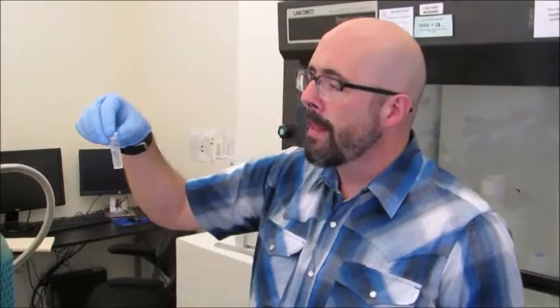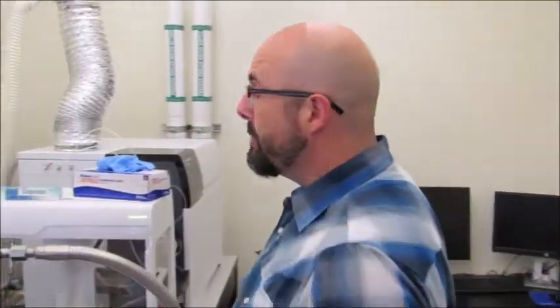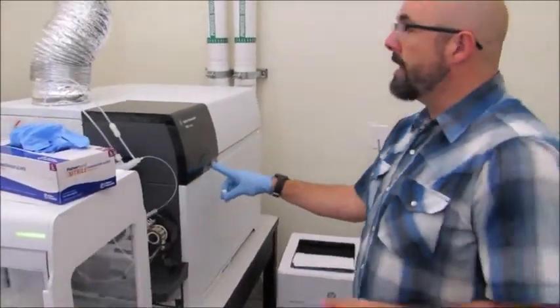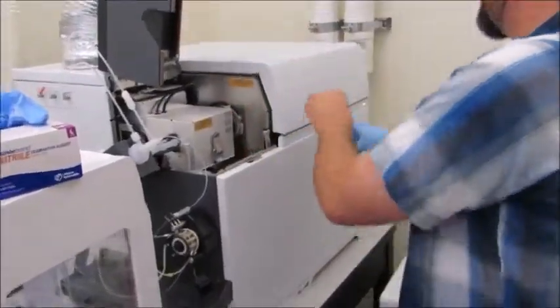The zircon has been spiked so that, just like with the helium system, we can measure the total amount. And then what we're going to do is measure this using this machine over here, which is called an inductively coupled plasma mass spectrometer, or an ICPMS is probably the term that maybe you've heard before. These are incredibly common machines in earth sciences. They're used for a variety of different measurements.